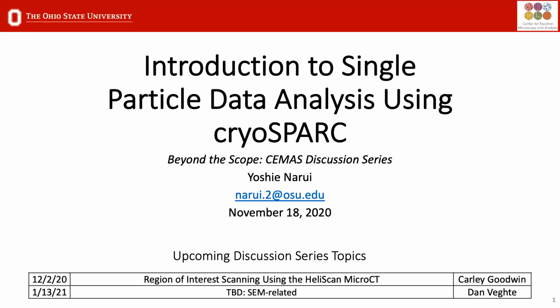Okay, so I'm gonna go ahead and try and switch here to CryoSPARC and show you the dashboard and a couple of important things to point out. So hopefully technology works here.